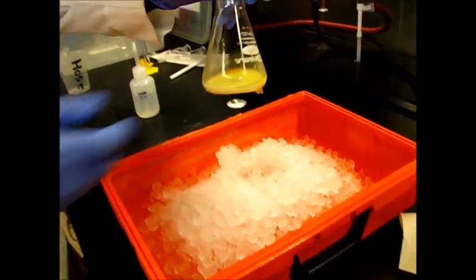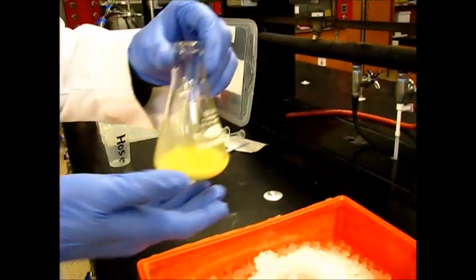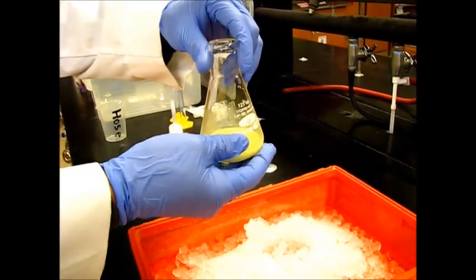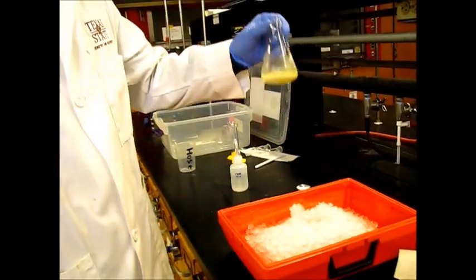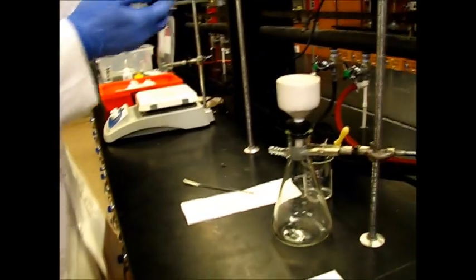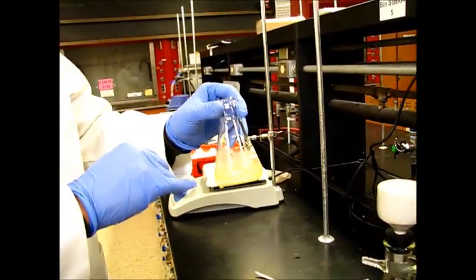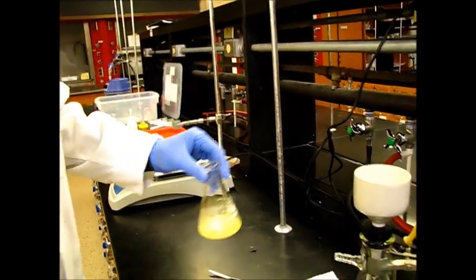We have set the reaction mixture in the ice for about five or ten minutes and it's pretty cool now. We're going to say the recrystallization is complete. Now what we have to do is perform vacuum filtration to separate out our solid, which is the para-bromo-nitrobenzene, from the liquid, which is going to be the ortho-bromo-nitrobenzene.